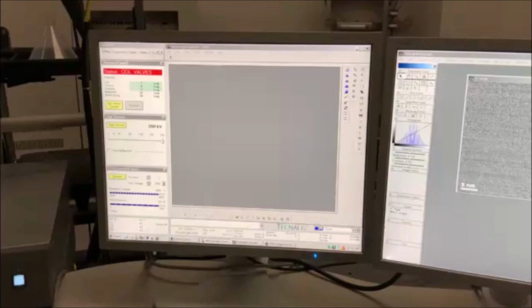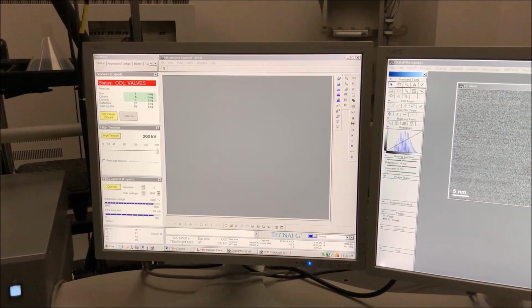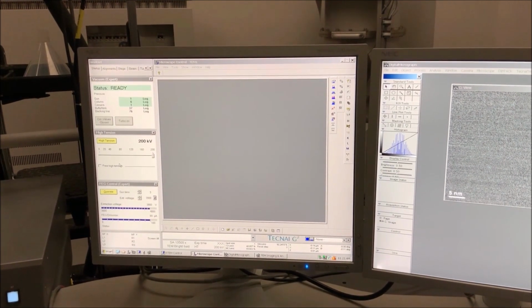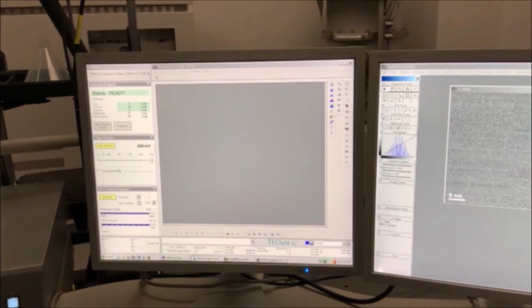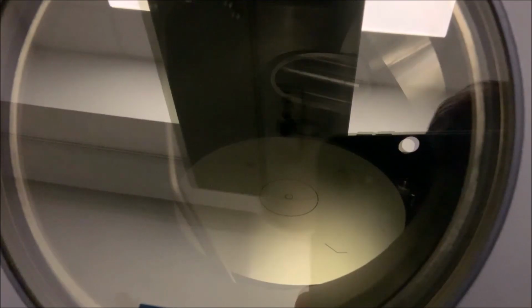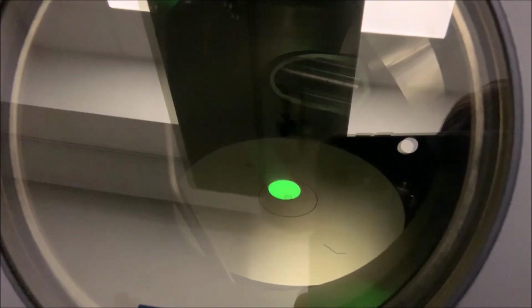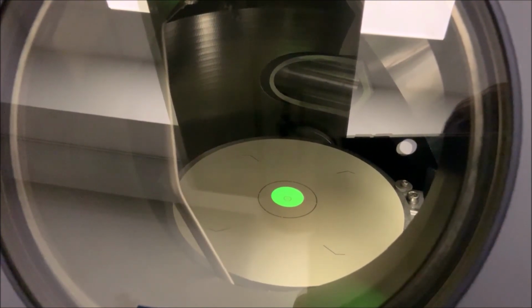Navigate to the Startup tab in Microscope Control and find the Vacuum Control panel. Select the Column Valves Close button. The button will change color from yellow to gray, and the status will change from Column Valves to Ready, indicating that the column valves are now open. The beam should be immediately evident on the viewing screen when the isolation valves are open, unless something is blocking the beam or it has been displaced from the current field of view.